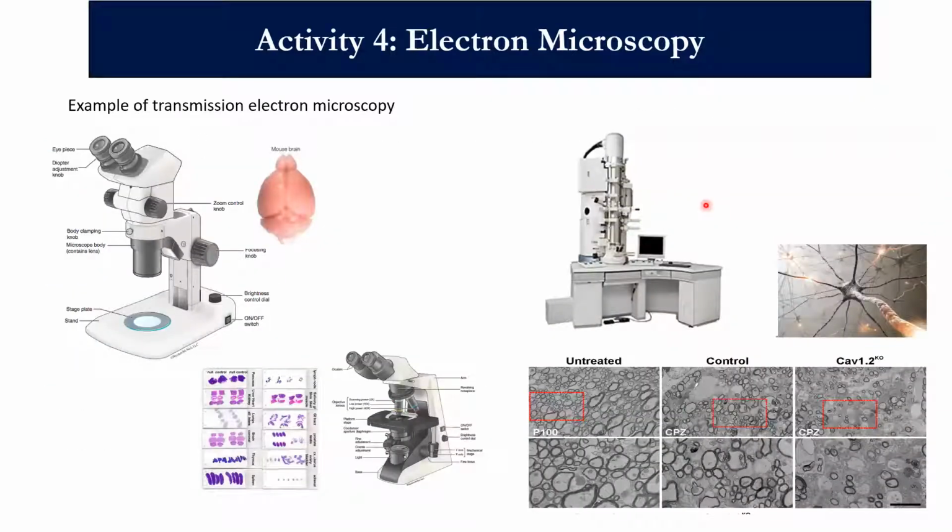So this is essentially how I conducted these experiments, just showing you the different microscopes you use. So you get your mouse brain and you use this microscope we talked about last week, which is called the dissecting microscope, to dissect the area of interest. So I used an area somewhere here. It's not important. But then I slice that relatively thin, and I look at it under a compound light microscope, which is this microscope here.